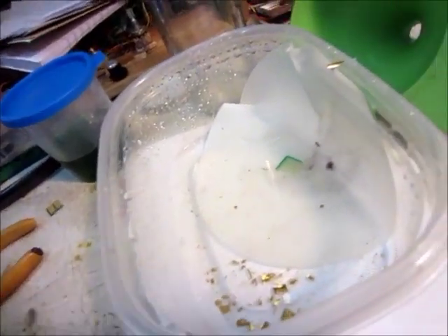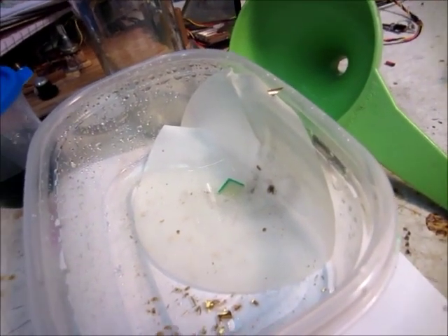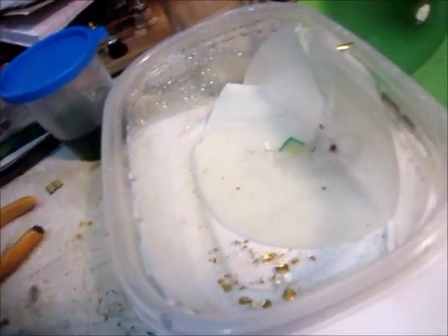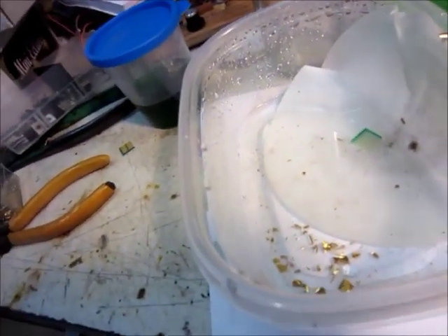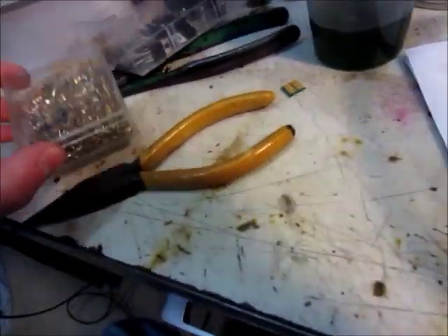Somebody on YouTube said that you could separate the gold off of pins with hydrochloric acid, so I thought I'd just put a pinch of these gold-plated pins in there and let it sit for a few days, and this is what I have.